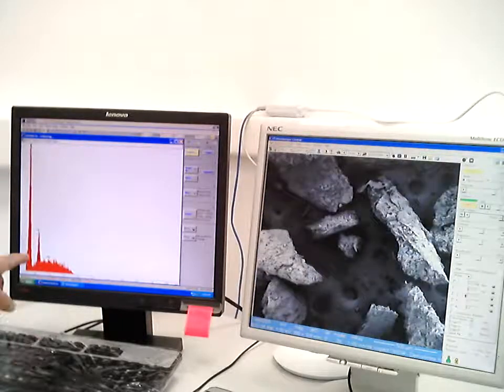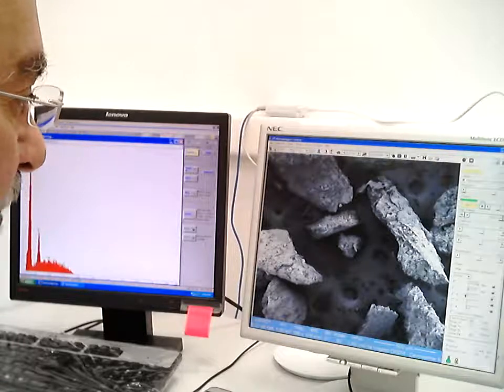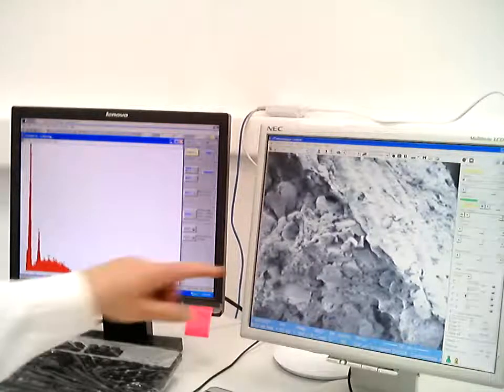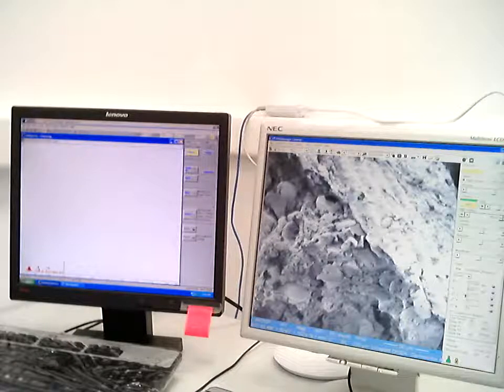It's interesting that it keeps on giving cobalt, which means that there is some cobalt in the soil that I took it out from. How about this one? This one looks like it's a mixture of stone together with some organics. Let's clear this and let it collect.